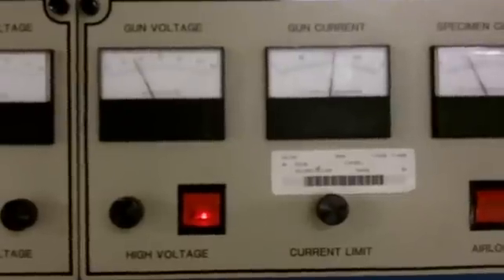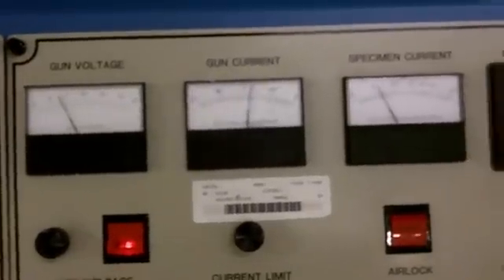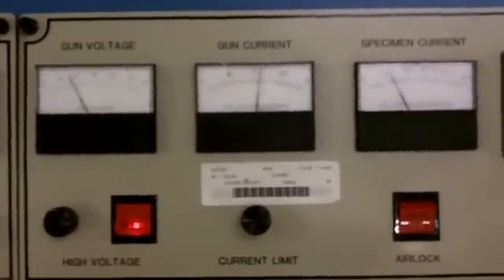As shown here, the top — in this case the red gun — is working on the sample. Here, both guns are selected. You can see the top, or red one, is on, and the bottom, or white one, is on, both acting upon the sample in the chamber. Notice our gun voltage, gun current, and specimen current are steady.